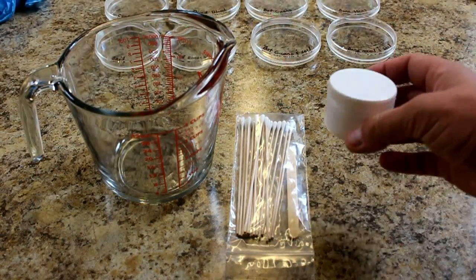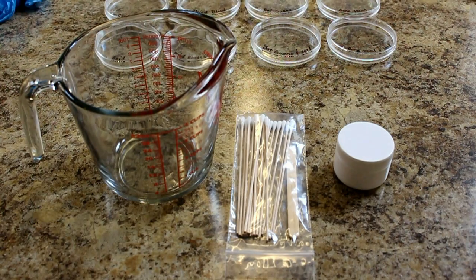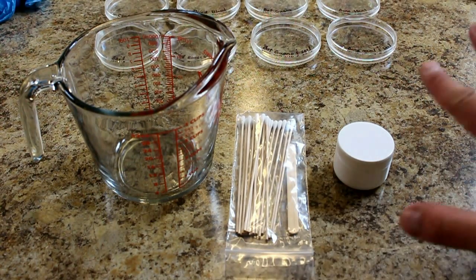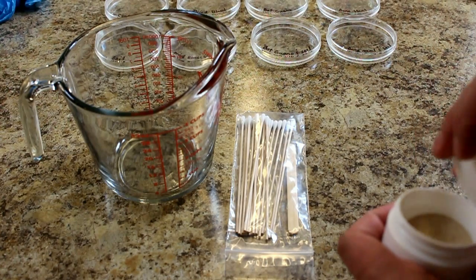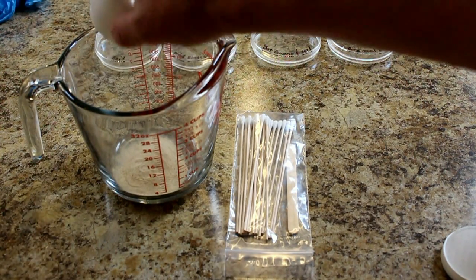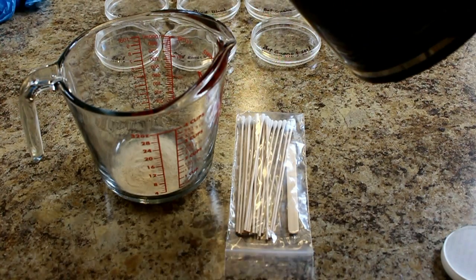So we've separated out 9 grams of agar. We're going to mix this with 300 milliliters of distilled water. We didn't actually have distilled water, so we used reverse osmosis water. We've also boiled this RO water, just to make sure that if any bacteria had made its way into the water, it wouldn't be present in this study. We're going to use this stick, which hasn't had any contact with the outside world, so no contaminants should be on it. I'm going to add the agar to the mixing cup and pour that in.